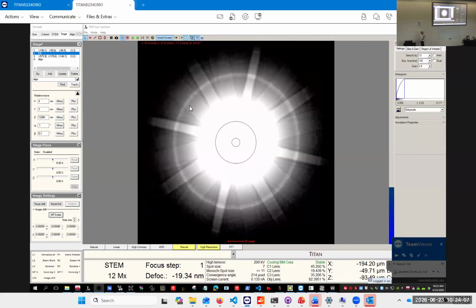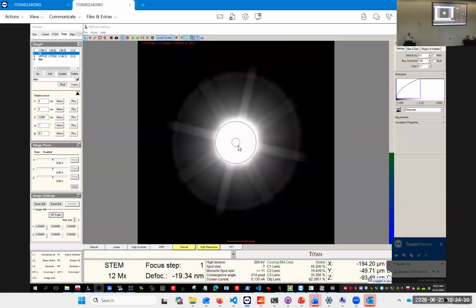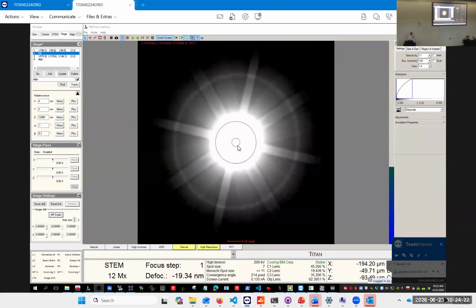So it means you get three-dimensional information from this diffraction pattern. So this is the higher order ones. Thanks for the question. I wouldn't have done that otherwise. We see our Kikuchi lines very nicely, right? So it's a star-like pattern. That's where we want to be at.